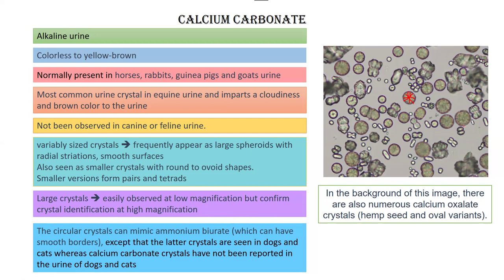The smaller variants form pairs or tetrads. In the background of some images you can also see numerous calcium oxalate monohydrate crystals in the hemp seed and ovoid variants, as discussed in previous videos. Small crystals are round to ovoid, while large crystals are observed at low magnification — if you have a urine sample under the microscope, these large crystals will easily be seen at low magnification.